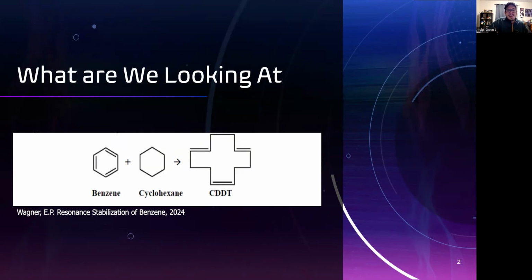Today, we're going to be determining the resonance energy of benzene through bomb calorimetry. Today, we will be looking at the evolution of heat in the combustion of organic compounds in constant volume conditions. This means that in these conditions, the heat will be equal to the change in internal energy for the reaction. This allows us to more easily understand the compounds in the experiment.